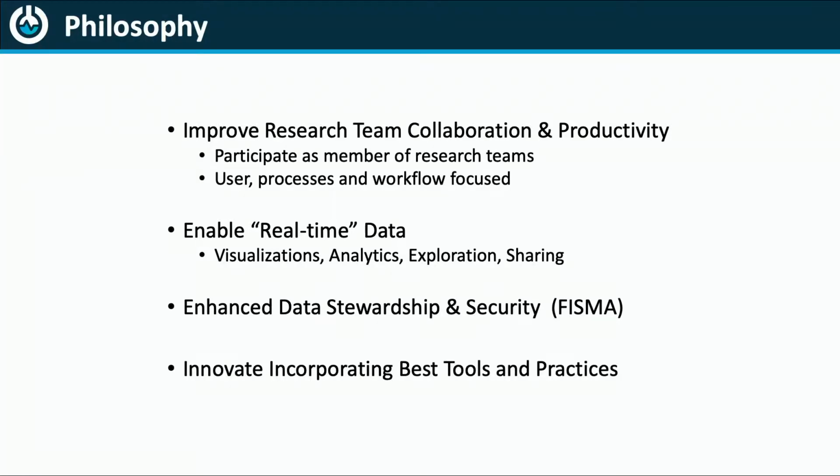We also will help with biobanking and getting the processes set up so that you can label your samples correctly. All that data gets integrated with the clinical data. And then finally, enhancing data stewardship and security. So the Federal Information Security Management Act has controls on your systems and how they can change and who has access. And then innovating and incorporating best practices. So we are constantly trying to achieve the best tools we can to help our researchers.